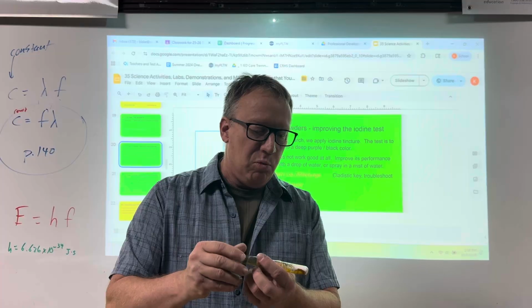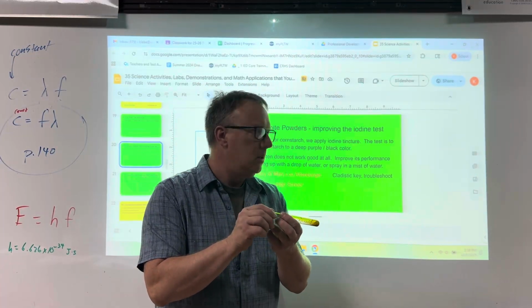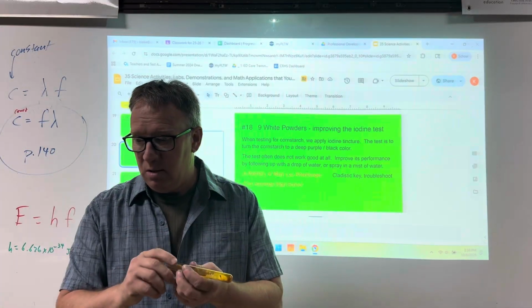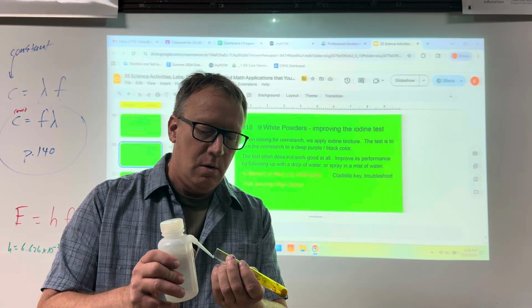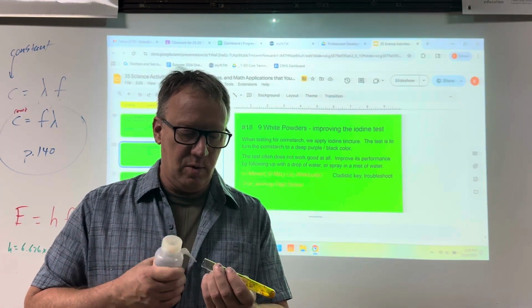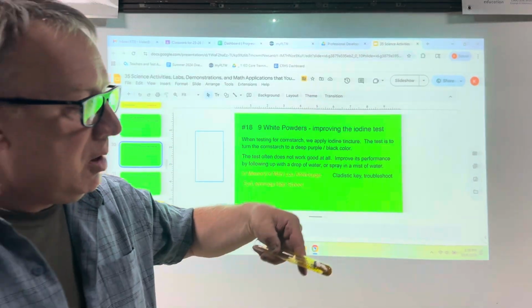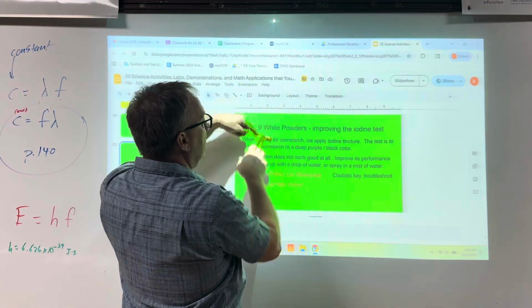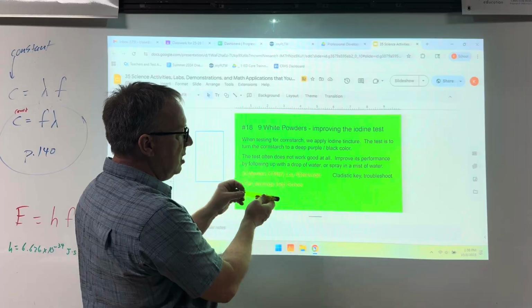I don't get any brown result. I mean, I don't get that purple black, okay? Because it needs a little moisture. I didn't know this. Just give it a drop. And you may see that come up. See? Just give it a little bit of moisture and that purple black shows up, okay? Just a drop. I put about 3 drops in there and it's too many.